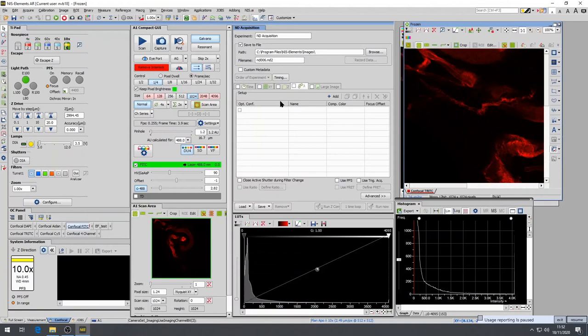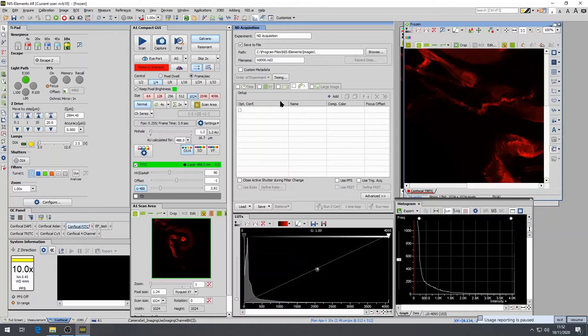And now I'm going to introduce the ND acquisition tab. This is also known as multi-dimensional acquisition tab. In here, you can set multiple predefined configurations for lambda for multi-channel images, Z-stacks, multipoint, time series, large scans. All of them are configured within this ND acquisition panel. You have to select the checkbox next to the corresponding multi-dimensional acquisition that you would like to activate.